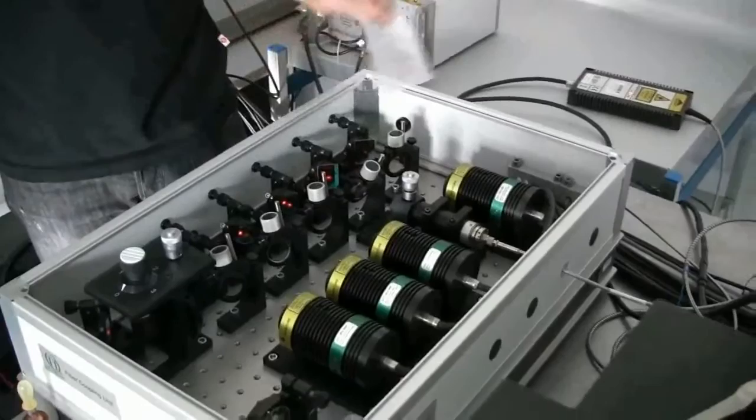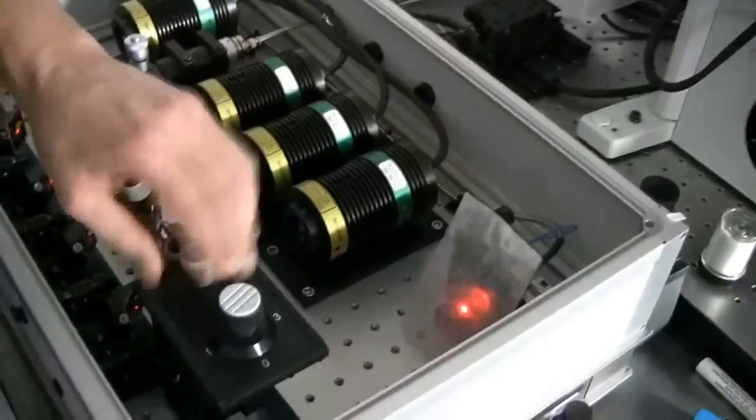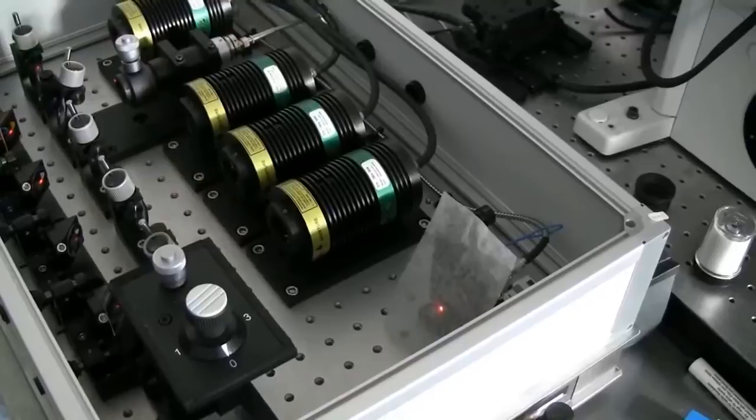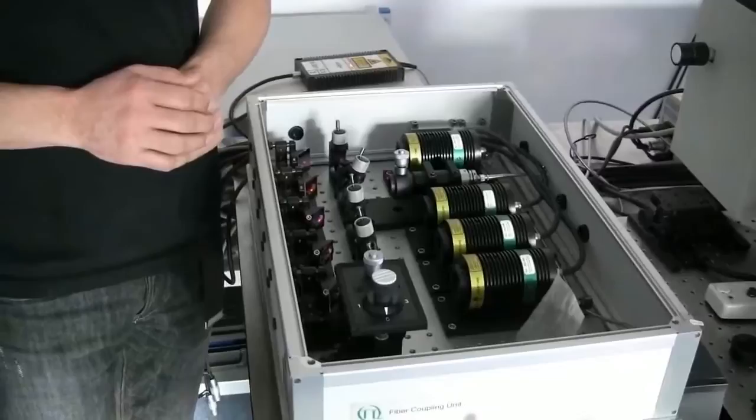Here in this box all the lasers are overlaid, so you can couple different kinds of lasers and overlay them and feed them into a single mode polarization maintaining fiber. The advantage is that I can do a lot of things to this laser beam — for example, I can use a kind of a knife to cut away portions of the beam to reduce the intensity. If you would do this to a laser beam and feed it normally into a confocal microscope, the focus you would get would be a representation of this distorted or cut-off beam, and you wouldn't get a nice resolution in your microscope image.